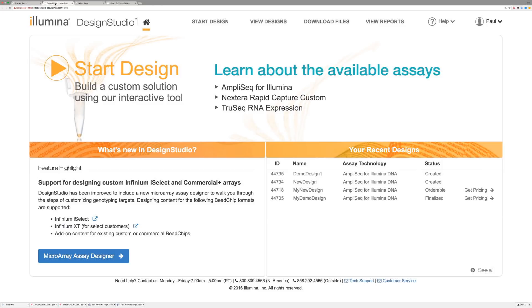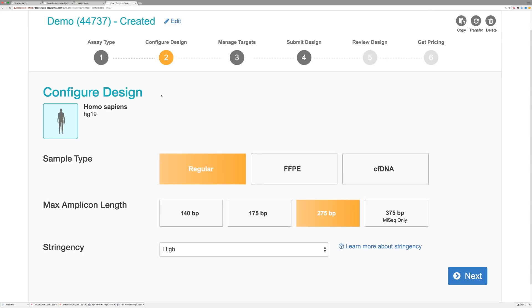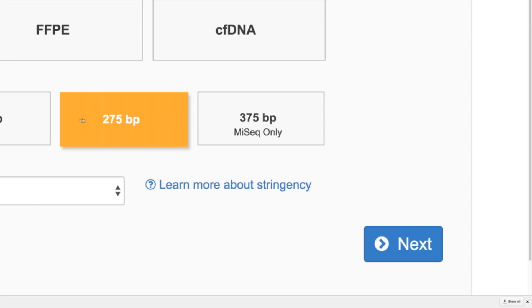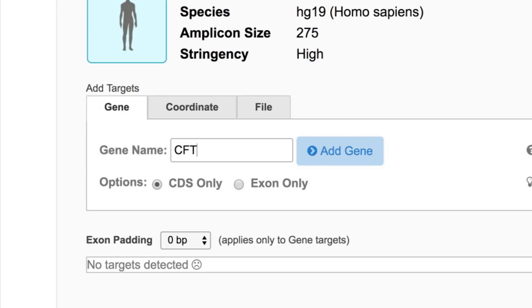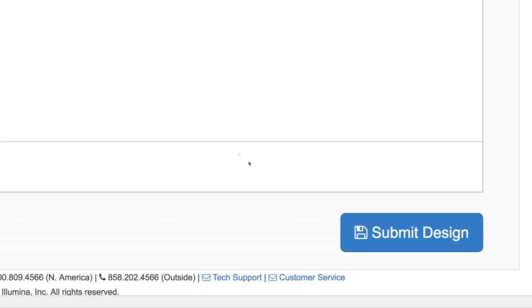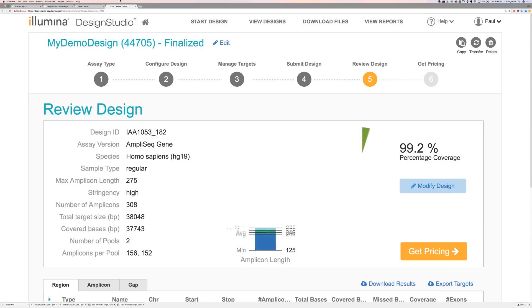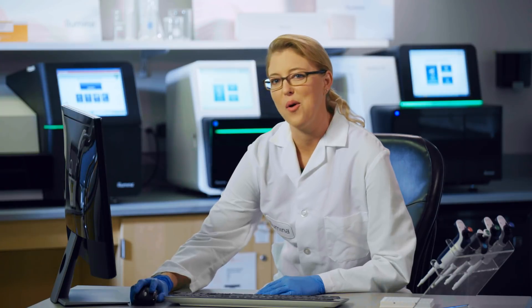The Illumina Design Studio Designer is a quick and intuitive tool for custom panel design. Users can personalize content to fit their experimental needs. Once inside the Design tool, the user would select Start Design, choose the desired input and species, select an amplicon size, and proceed to enter gene names or coordinates for each target of interest. When finished, select the Submit for Design button. Finalized designs are usually ready within a few hours.